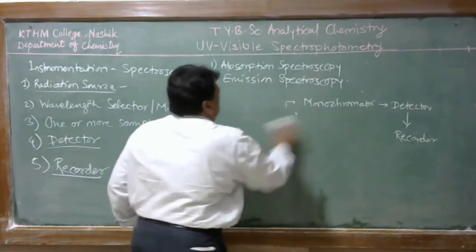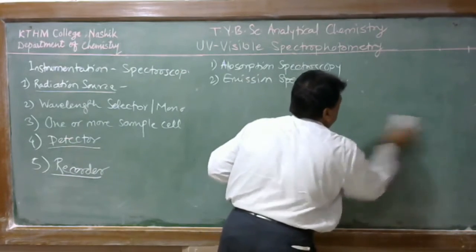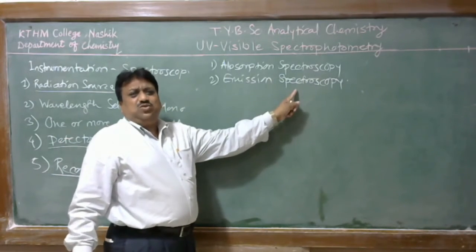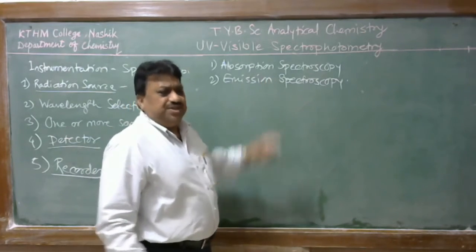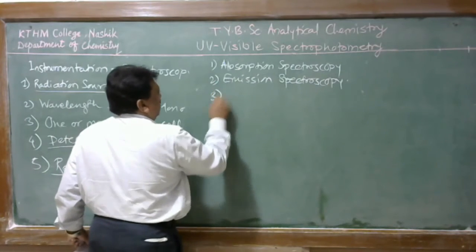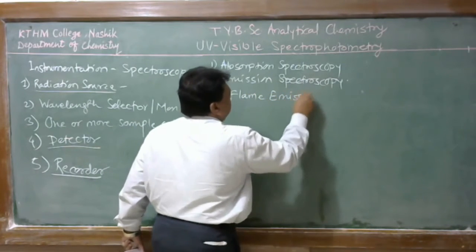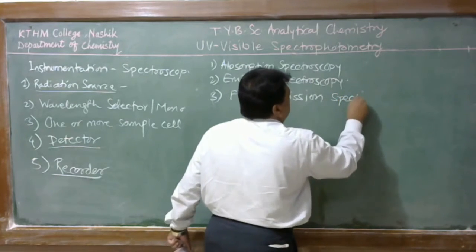Now this is for molecular absorption, or this may be for molecular emission spectroscopy as well as for atomic emission spectroscopy. More specifically, we can say, for example, flame emission spectroscopy, that is an emission spectroscopy.